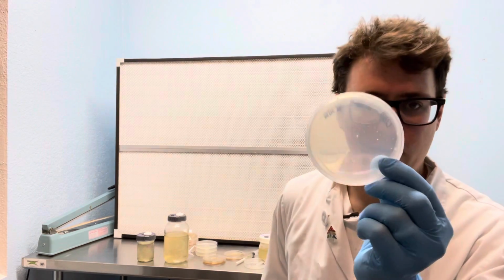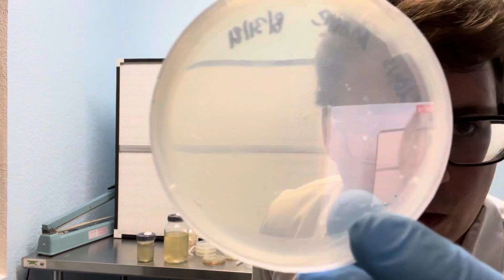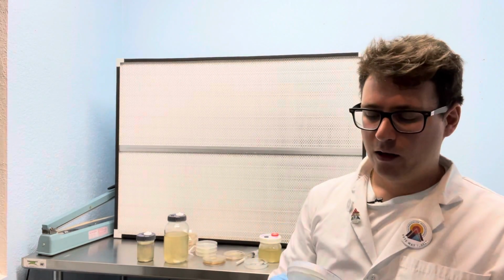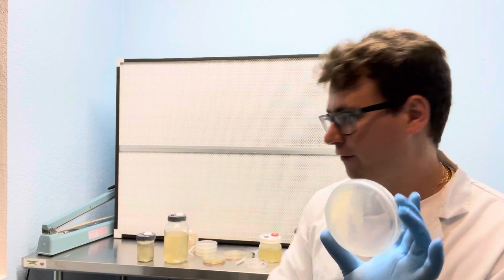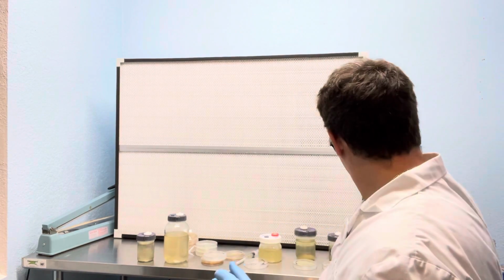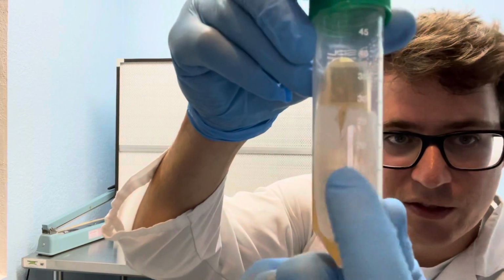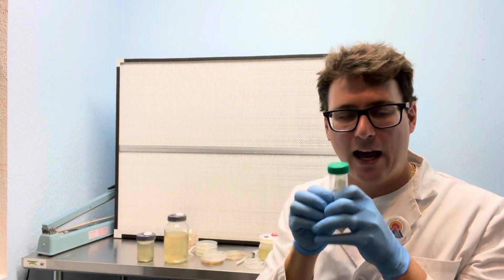With an agar, you are going to observe growth in a two-dimensional fashion. You're just looking for colonies to start, or if you made a transfer from another culture like a slant, it would look like this. It will start with a central point, and then the healthy mycelium is going to expand outward.